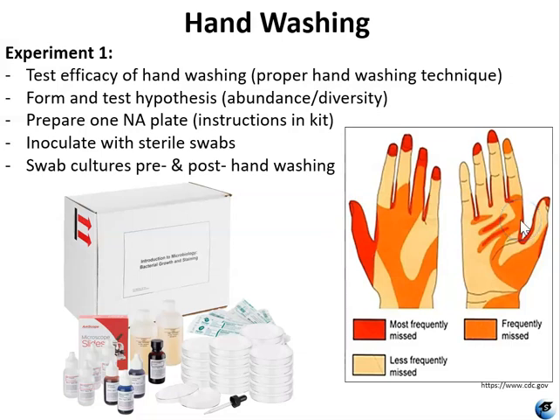If you're not sure how long 20 seconds is, it is about the length of time it takes to sing the Happy Birthday song twice. Finally, you're going to want to rinse, and when you're rinsing, you are going to be performing the same motions, like rubbing your palms together and cleaning in between your fingers and going up above your wrist. You do all of the same motions that you did for lathering. Do those while you're rinsing.